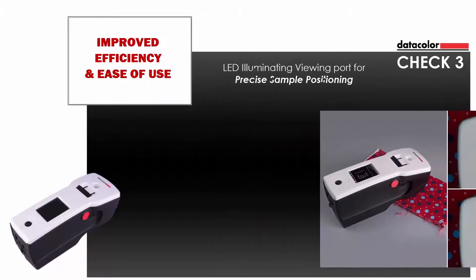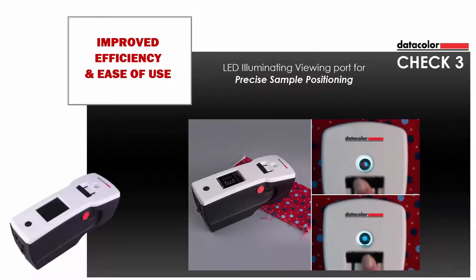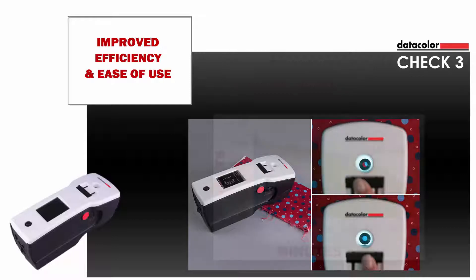The instrument has been thoughtfully designed to assure proper sample alignment while maximizing product usability and experience. It includes an LED illuminated viewing port, enabling users to very precisely position samples and assure accurate measurement. The change to a horizontal configuration allows measurement in height-constrained areas.